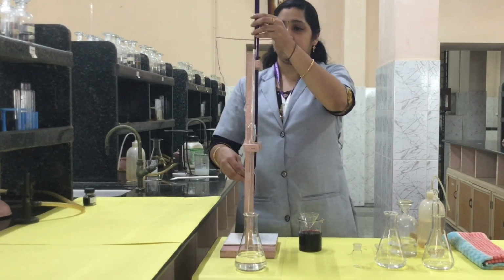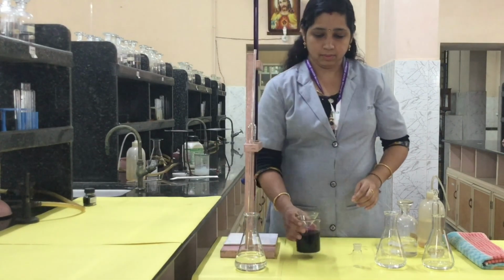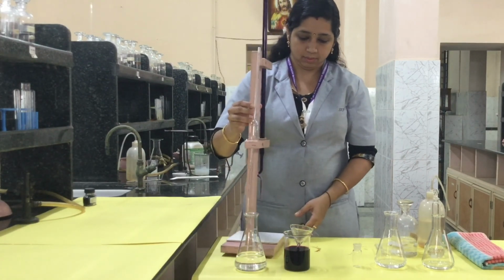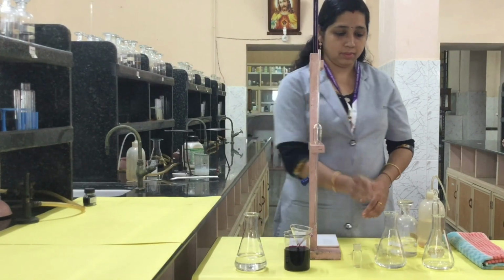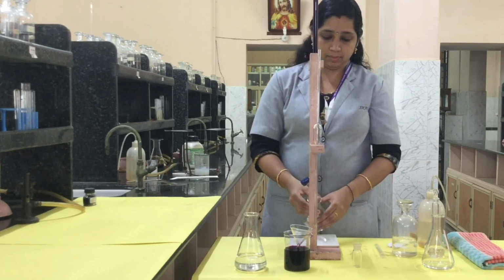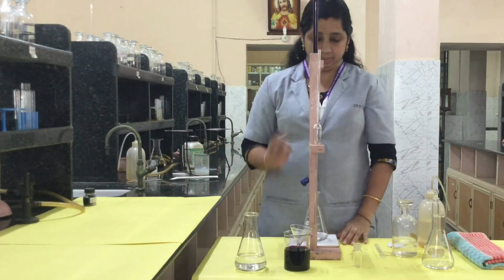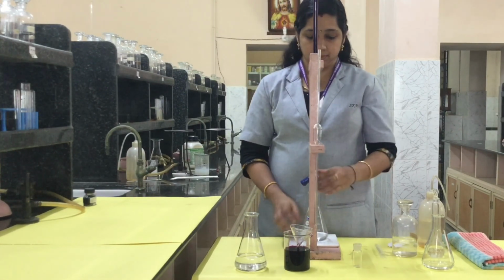Okay, now this burette is filled, the nozzle also is filled. We have already taken 50 ml KMnO4 in the burette. So the burette is ready for titration, and the conical flask contains 20 ml Mohr salt solution plus 1 test tube full of sulfuric acid, that is ready. So now we can start our titration.